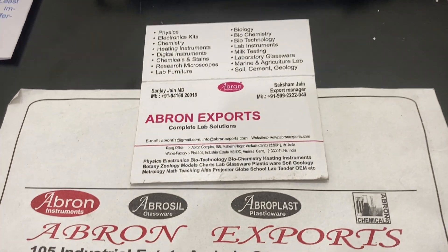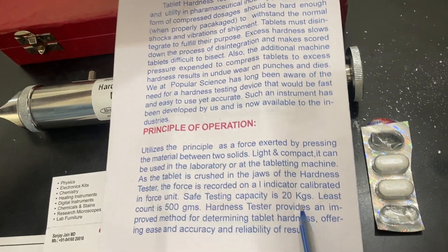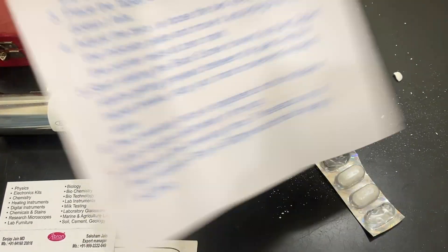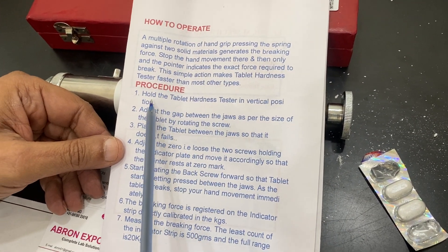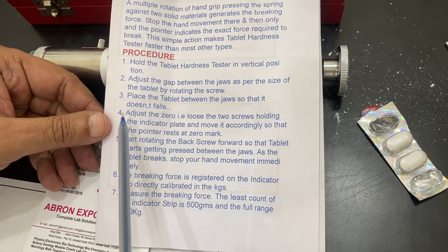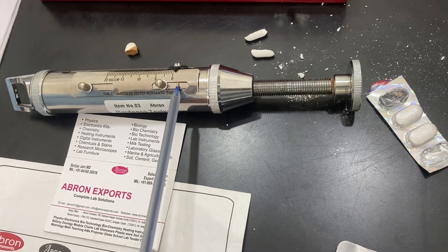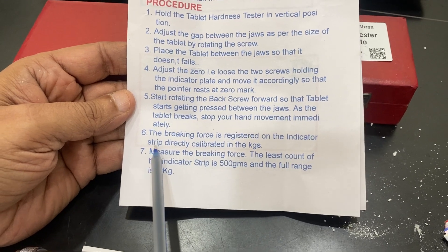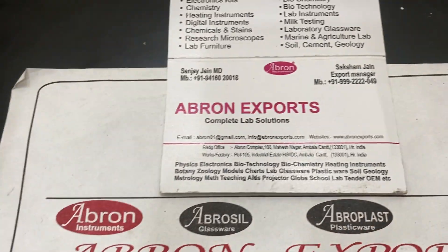Visit the website and share the videos. The manual also comes with the device and tells you about the working, all the parts, and the principle of operation. It has a maximum capacity of 20 kg and a count of 500. To operate: place the tablet vertically, adjust the screw, place the tablet between the jaws, adjust to zero using the two screws, then start rotating the screw. The break force registers on the indicator strip. Measure the break force. Visit the website, share and like the videos. Thank you very much.